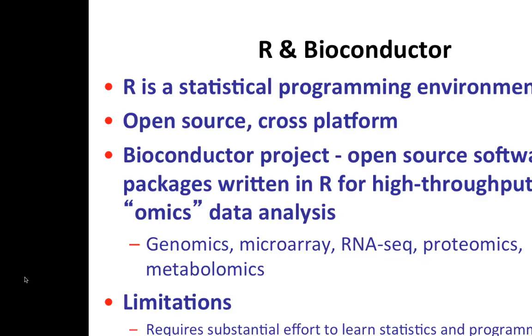So this is a very brief mention of R and Bioconductor. We do have an R review session before this workshop. We only saw four people, but I guess you already did your homework. So I'll just briefly mention R is a statistical language. It's free and open source, and it's quite unique, so it's really worth learning. Even if you're not comfortable with the command line, it's really worth the time to learn a bit, and gradually you'll find it's quite useful.